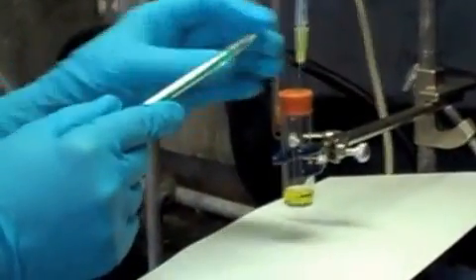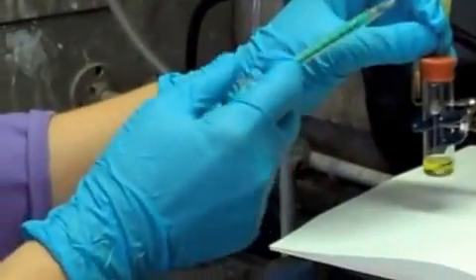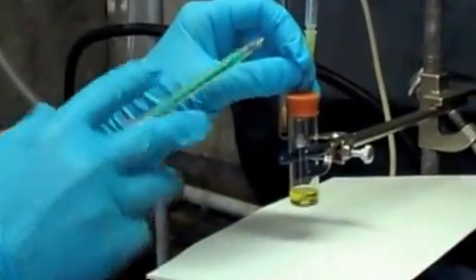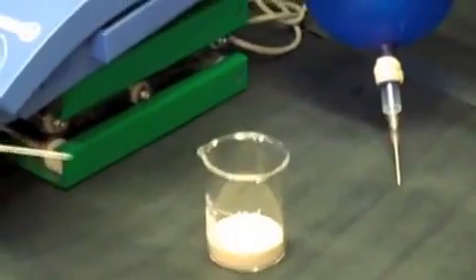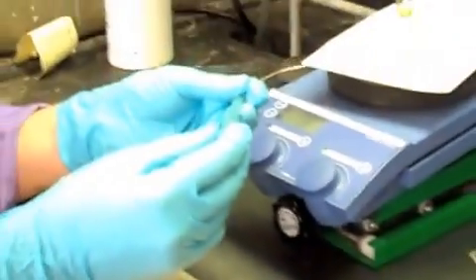I have a little bit of BuLi left in my needle, and I need to get rid of this. We keep a sand bath close by and don't have any flammable liquids in range. I can squirt the last bit of my BuLi into the sand bath and discard my needle.